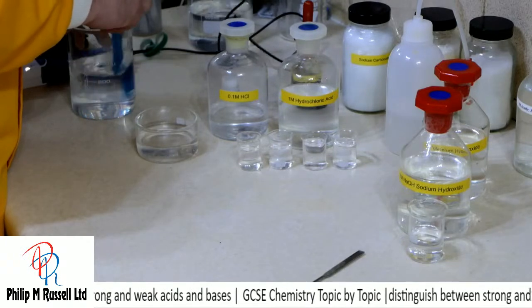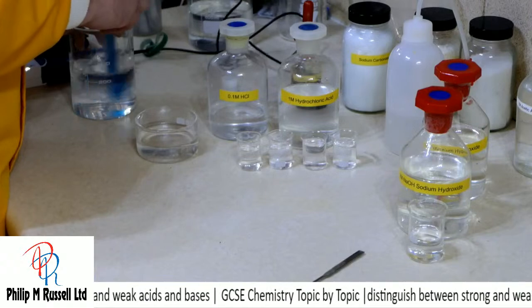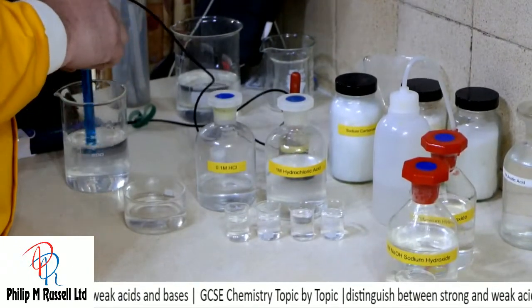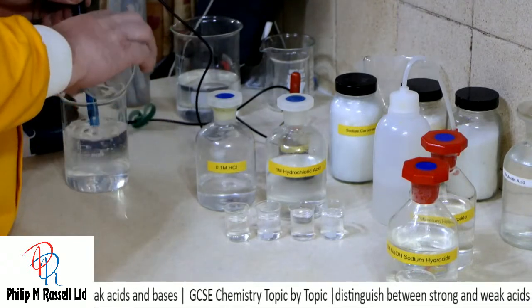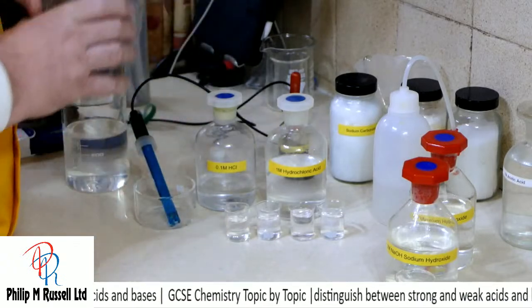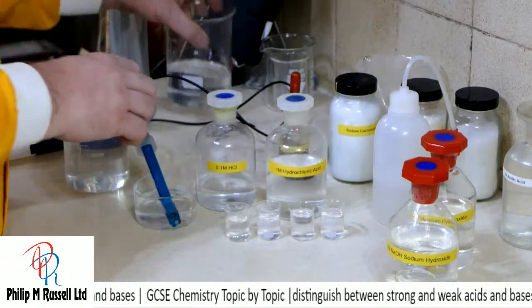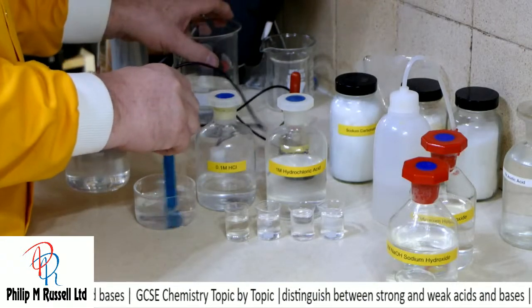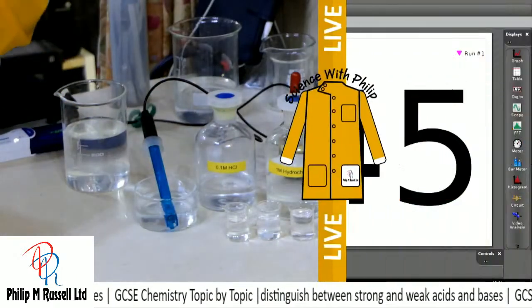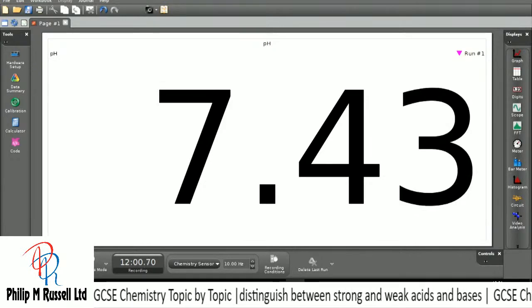Just finish off with cleaning up my pH probe. Giving it a good wash. And we can see that is down to about what it was before, about the 7.